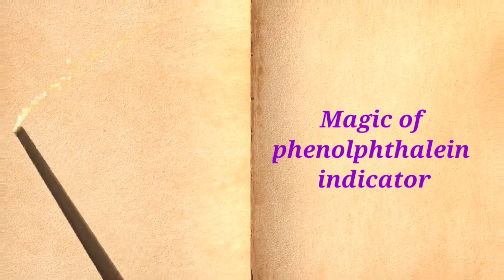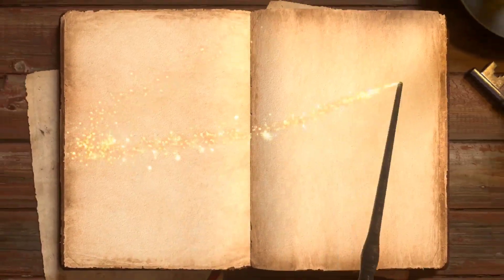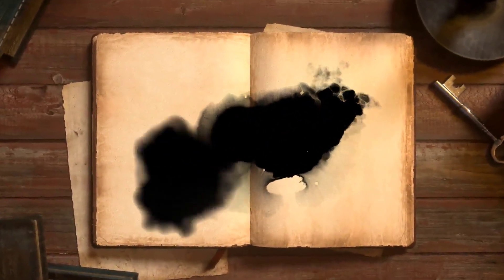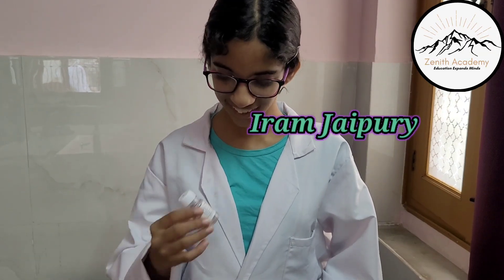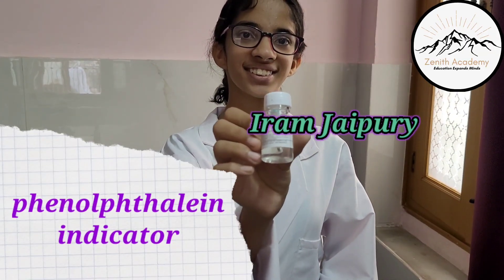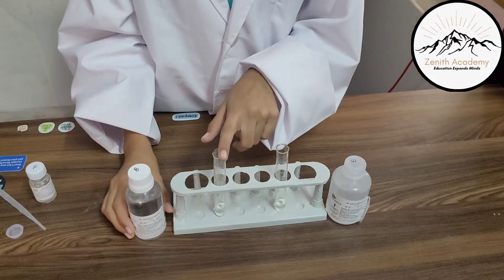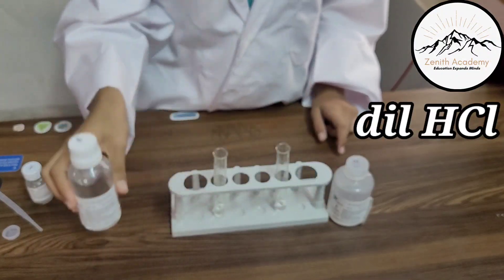Hello students, today we are going to see the magic of phenolphthalein indicator. Phenolphthalein is used to distinguish whether a given solution is an acid or a base. This is Iram Japuri, my daughter, and she'll be demonstrating the phenolphthalein indicator. Here she has taken dilute hydrochloric acid.